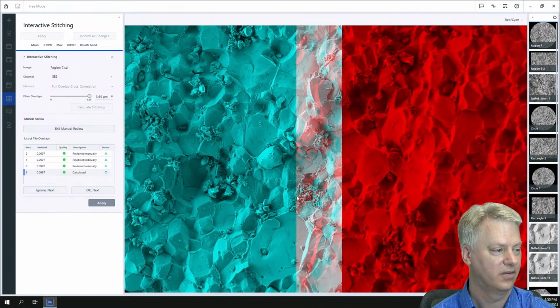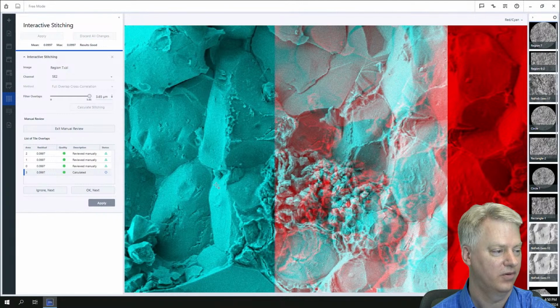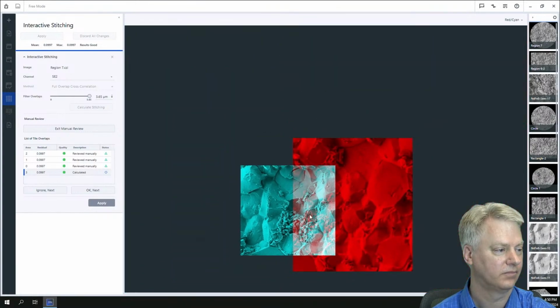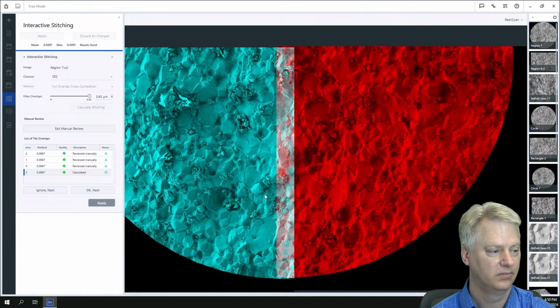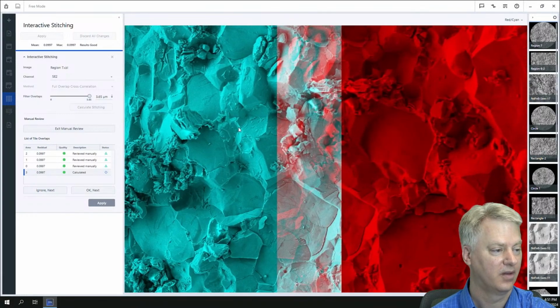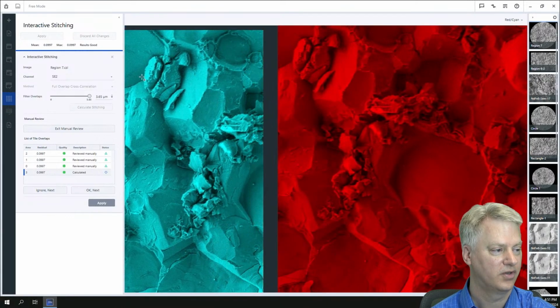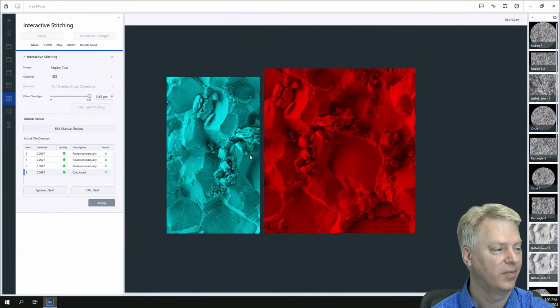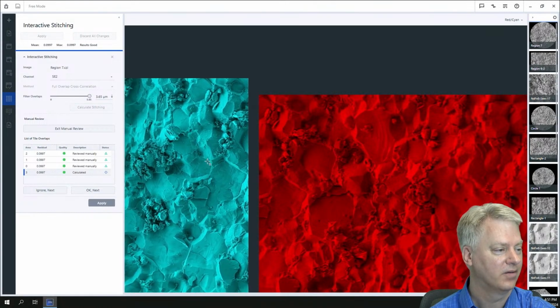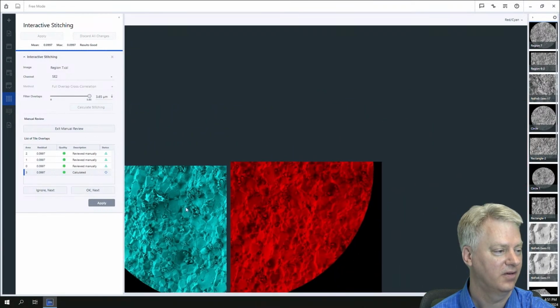All right, so there's the alignment between all of the tiles of the circle here. Just give me a moment to finish this last one here. That one's good, and I'll just click apply to apply it all. This was double checking this one. I thought I saw maybe there was some mismatch here, but I think I probably had it correct, but there's a little better feature that's down a little bit that it may be easier for it to identify and to correlate between the 2.